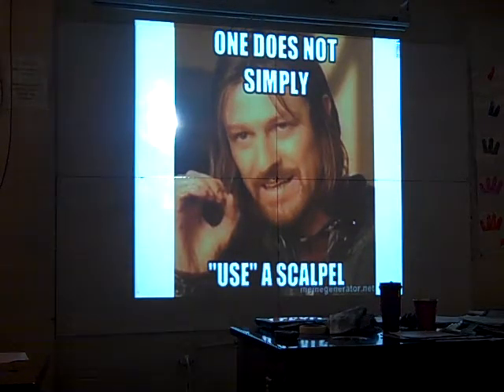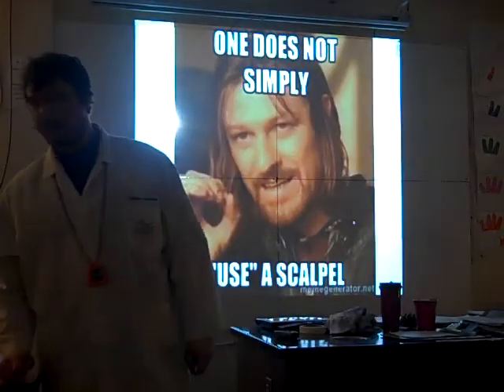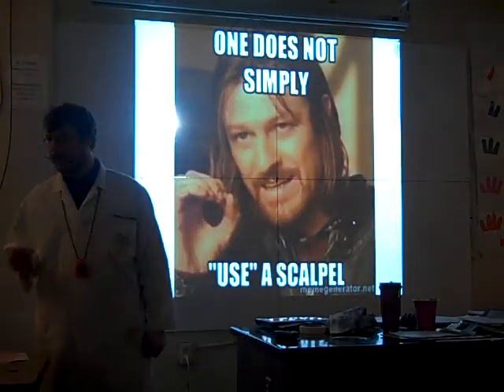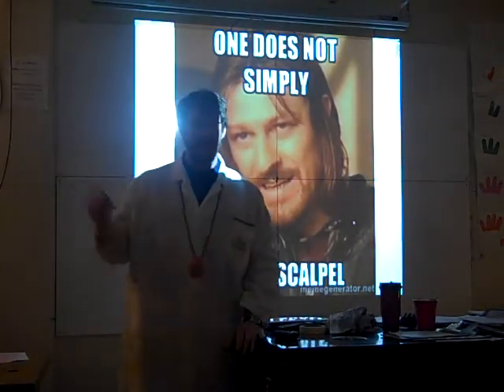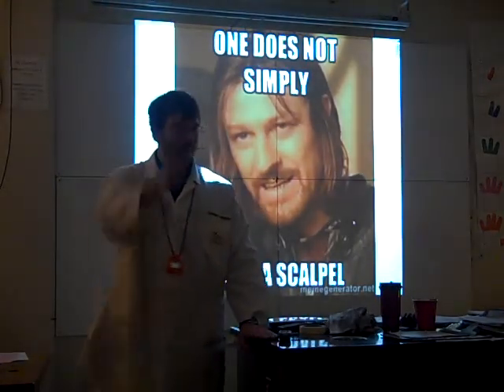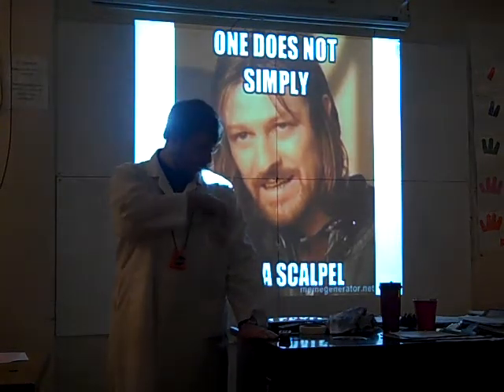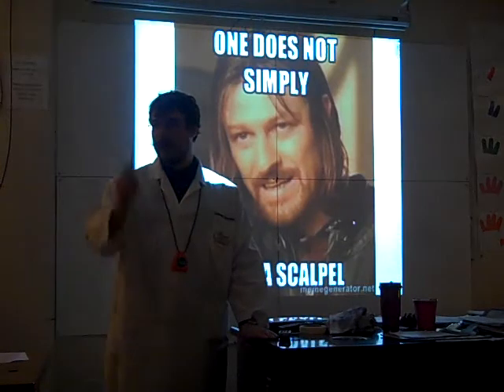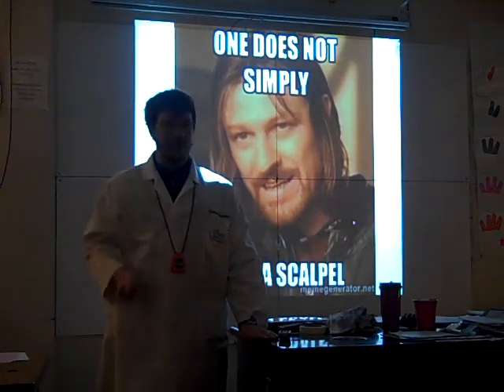We'll go backwards. Start with number three. The scalpel is a very, very, very dangerous tool. It's a precision tool. You need to be very careful when you're using it. Common misconception about all blades: if it's not a serrated edge, it's not meant for sawing back and forth. That goes for kitchen knives, all that stuff. The scalpel blade is non-serrated. When you use it, you want to just follow your same line. If you don't get the cut the first time, just follow that same line.